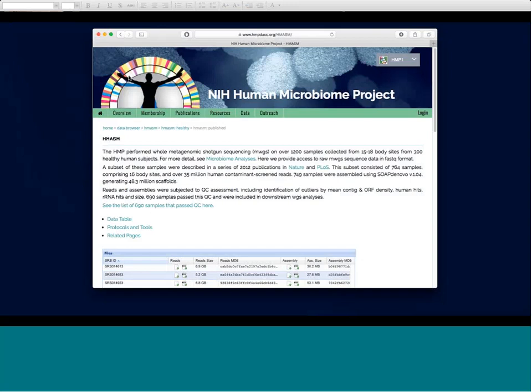The Human Microbiome Project, you may be familiar with. They're collecting and sampling a fairly comprehensive set of samples from various locations on the human body. You can see the web address of the site here. On the bottom of the screen, you can see our sample number ending in 683, which is the one we're going to be running. It's about 5 gigabases of reads.